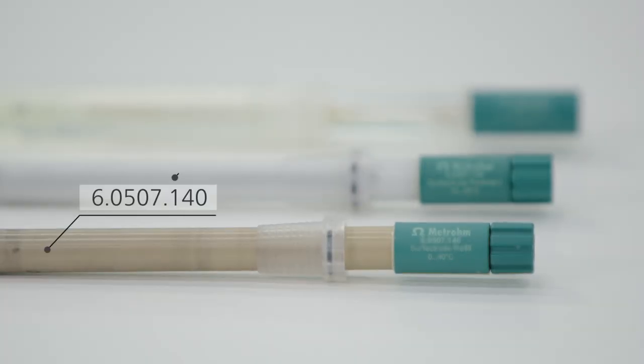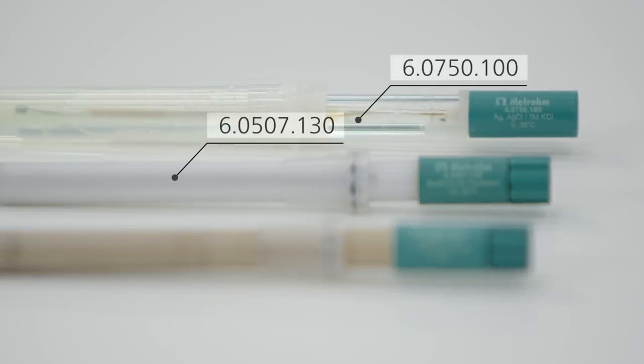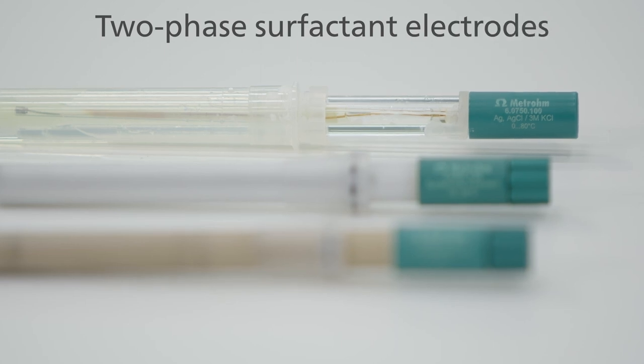We offer two different electrodes for two-phase surfactant titration: the surfactant refill and the surfactant resistant. Besides the surfactant electrodes, you also need a reference electrode. We recommend the LL-ISE reference electrode.